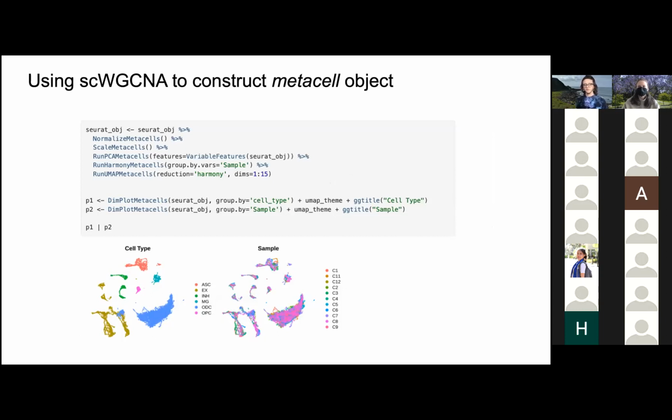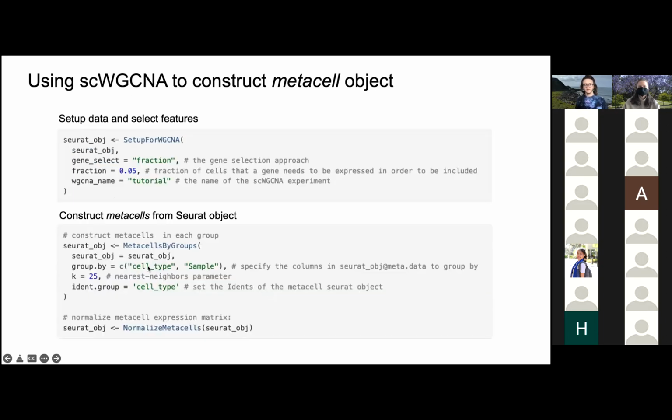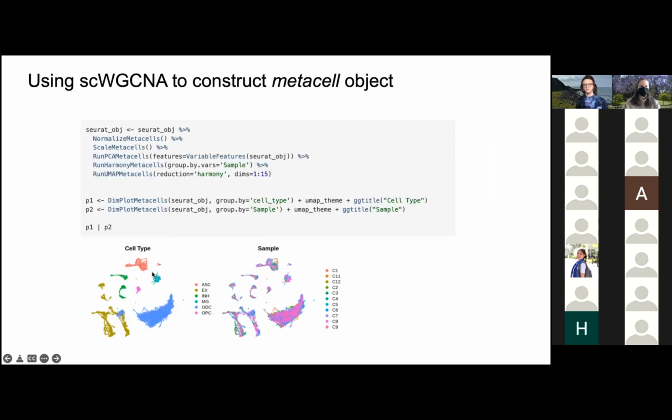So if you want to retain this information for downstream use, you have to specify. But you're not actually running WGCNA on the sample, it's just for the metacell construction. Yeah. We used the inhibitory neurons for this whole thing, and in the inhibitory neurons there are metacells that come from all the different samples. Got it. Okay, so they're all there together.